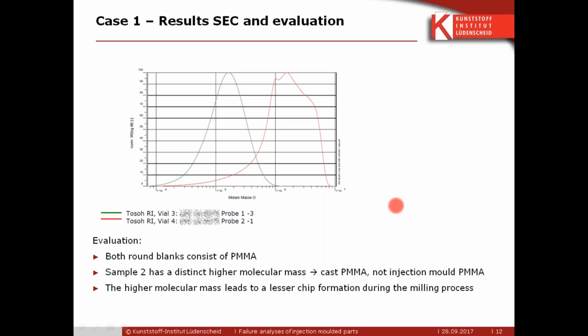So from my perspective, with respect to density changes, so changing the density of the polymer, it's actually quite hard. You can change it a little bit by different processing. However, if you look at this graph, the molecular weight differs by one order of magnitude. So this is not just a few more monomers, but it's one order of magnitude more.